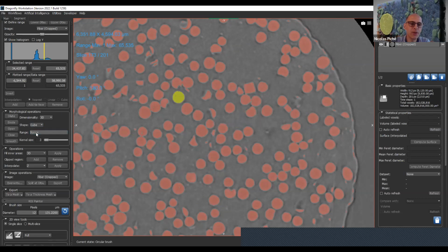Of course, you can even specify a range of action, from the 12th slice to the 70th slice, for example. You can constrain the action to a specific range of slices, and here you can even skip slices. Here you see the syntax, so you can do one out of three, stuff like that. So it's a slicing operation on the dilation and all the operators that you have here. And as I said, it's only working on the range if I have specified it.